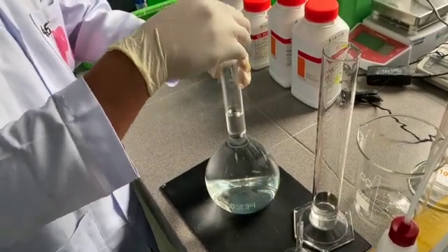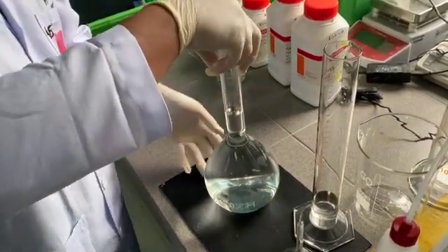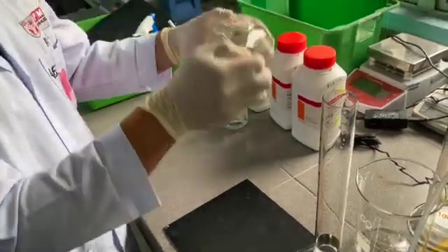We will put the cap and mix the solution well using the volumetric flask.